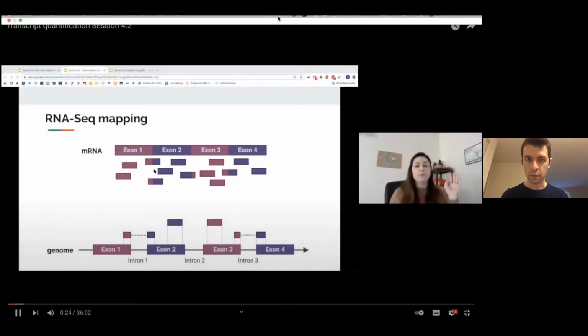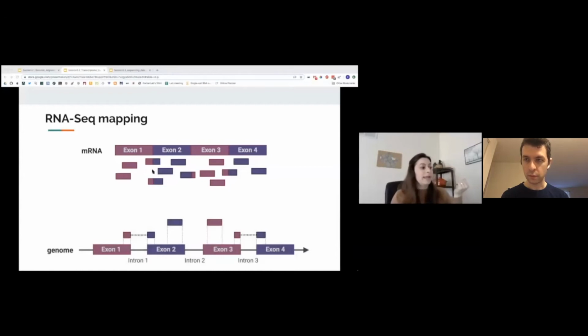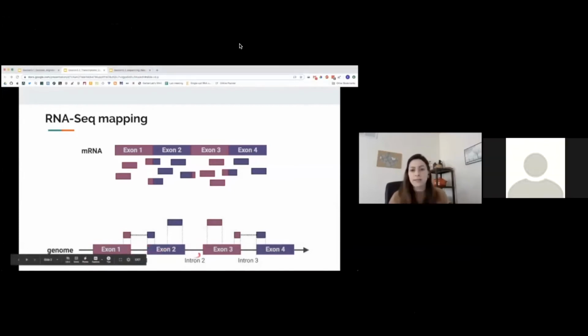We're talking about paired end reads and how you can use the probable distance between them. And I know some of you were asking questions about the aligner and the fact that it has to deal with the introns. So I just wanted to remind you all that this example is showing a very short intron. It's just a representation. But in reality, you all know that introns can be hundreds of kilobases long. You can look in any genome browser and see the actual size of introns.